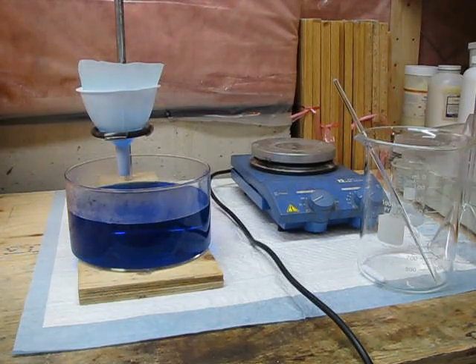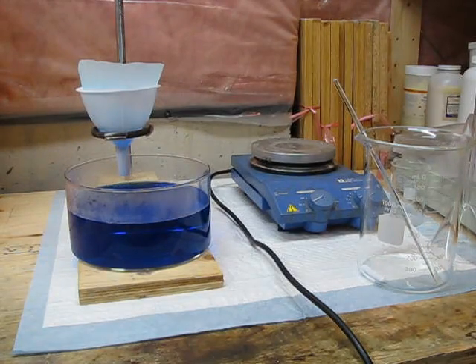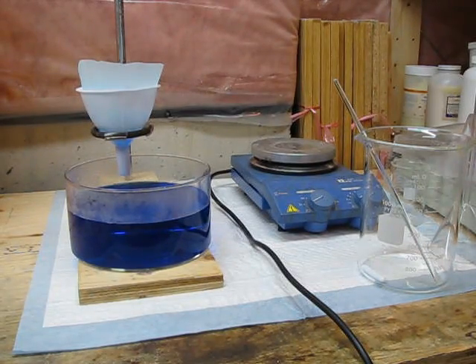I was just dissolving a large amount of copper sulfate into a liter of distilled water for a crystal growing experiment. However, that's not what I wanted to talk to you about today. I wanted to bring you a quick little lab tip.